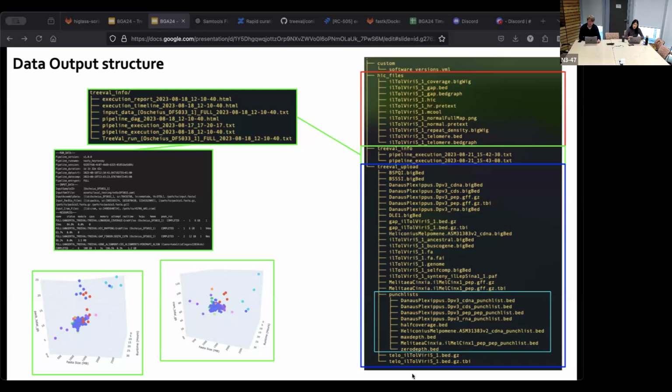So we combine these two haplotypes together, and then the Hi-C map will look quite different. You will see some parallel signal alongside the diagonal line. And this is very important for the curators to flag out if the duplication event, if the haplotypes still remain in one or the other.